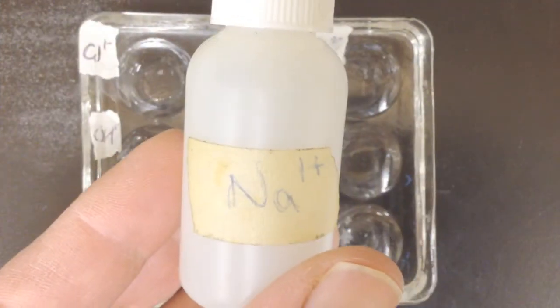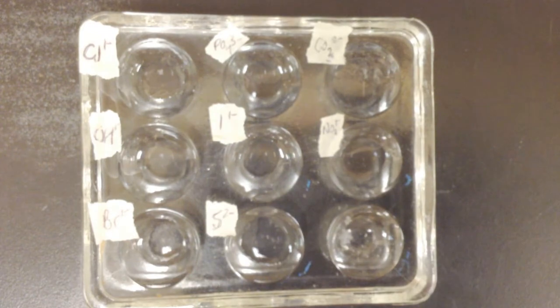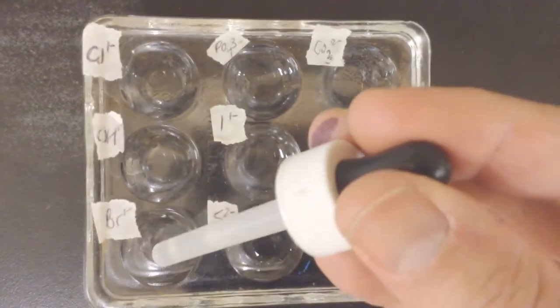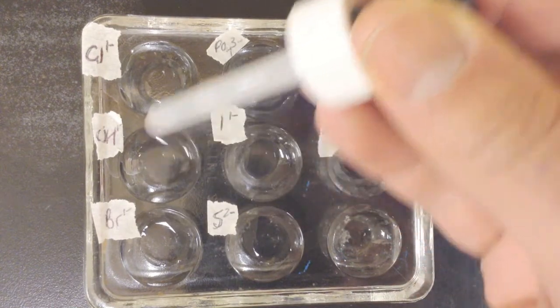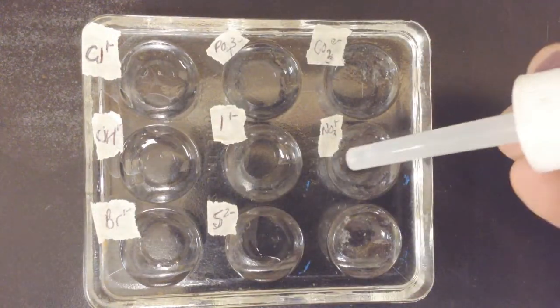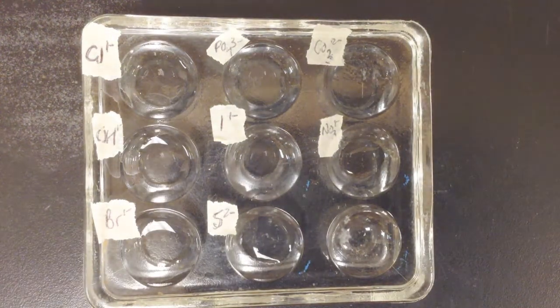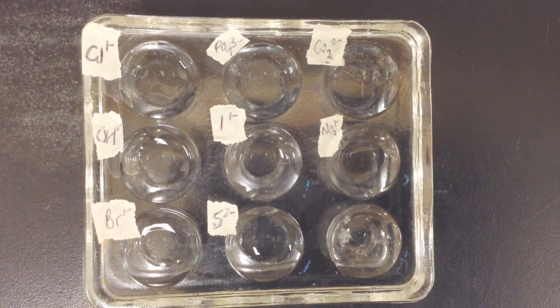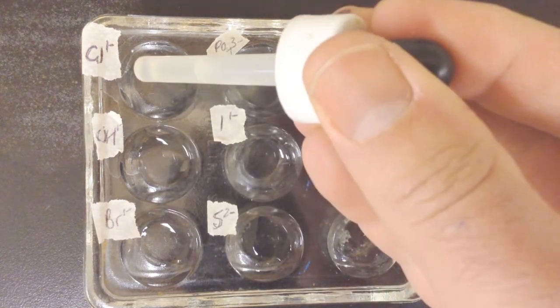All right, first up is sodium cation. I'm going to take this and place a drop or two in each one of these wells. Now what you're going to be looking for is just evidence of chemical change. So here is chloride.